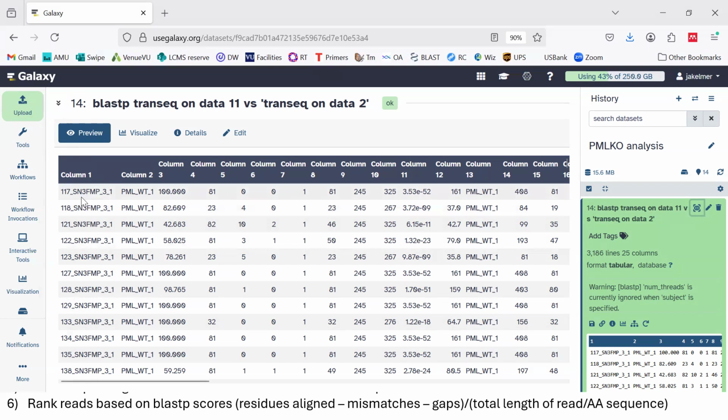But you see, it's not so dire once we get past there, okay? And actually, if you look here, it says we still retained about 3,000 reads out of what were probably 5,000 to begin with, okay? So that is a lot, definitely. We would have preferred to keep more of those, but you got to get rid of the truncated reads, the ones that are too long, etc.